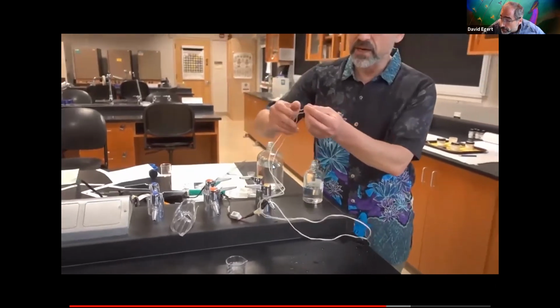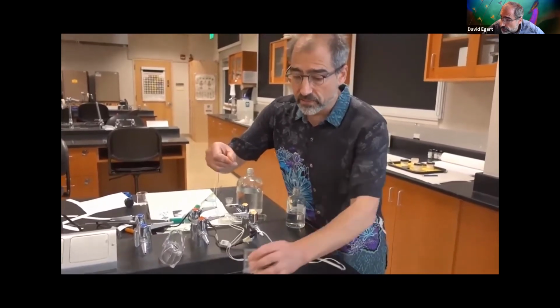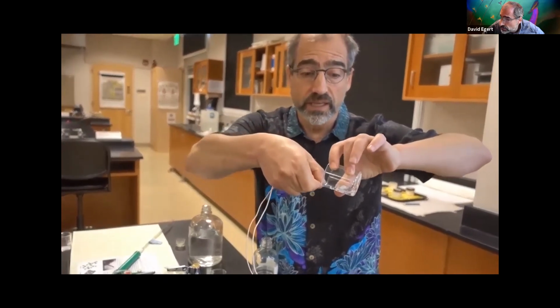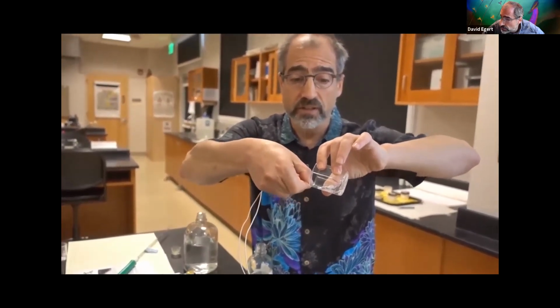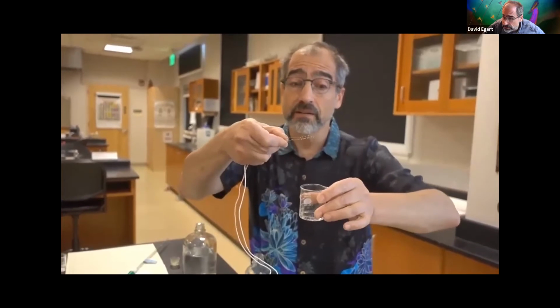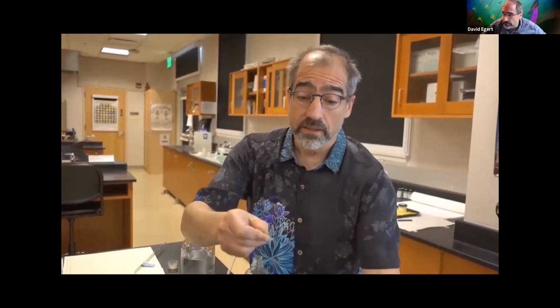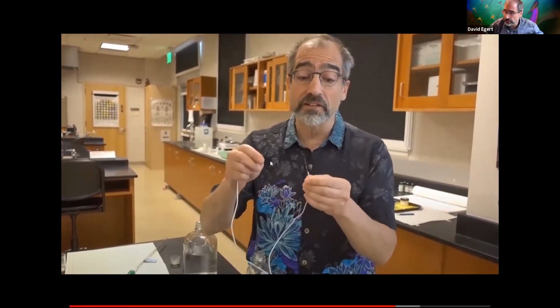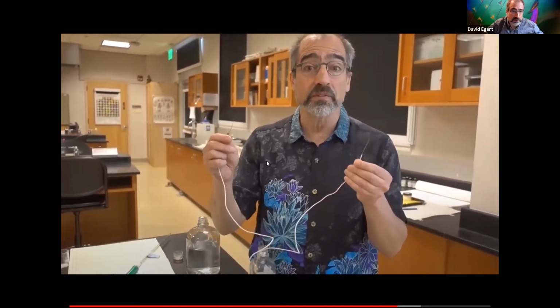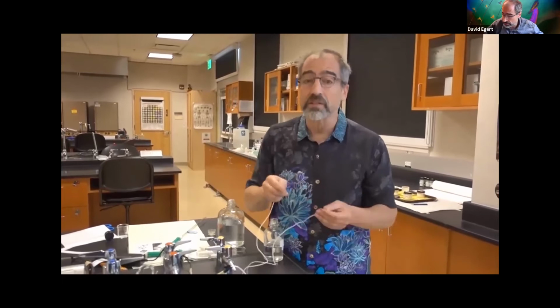Then I take my wires, holding them parallel so they're not touching, and I'm going to submerge them in this mineral oil salt solution and make sure they're fully submerged. And now I don't hear anything. Right? Air, no buzz. Oil and sodium chloride, no buzz. Again, you can double check, fail safe, make sure the system's actually working. If I touch the wires, I totally hear a buzz. So the system is working. It's just I did not have an electric current when I was testing my solution.